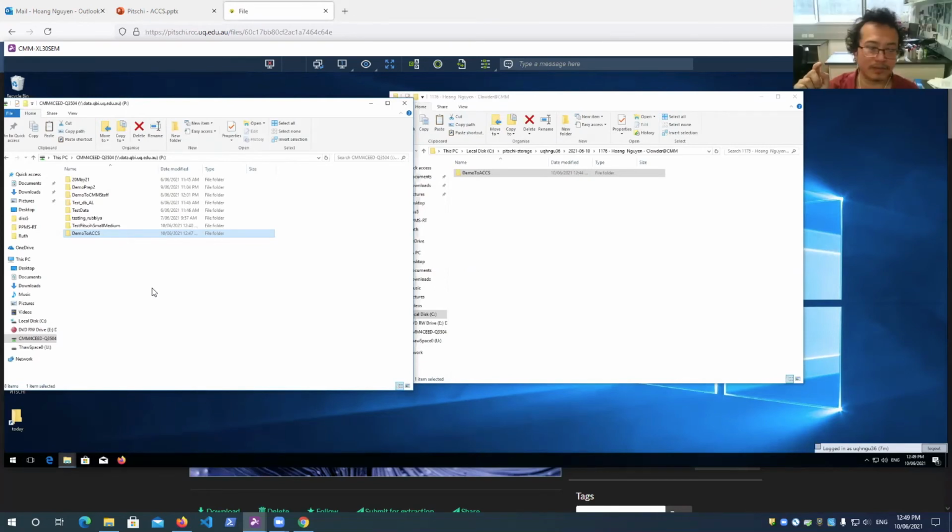So James, well, actually, before this demo, which is using PPMS, I do have it working with UQ login. But like I said in the slides, there's some cases in CMM where a certain program needs to be on all the time, so I cannot use it, but it does work with UQ login. With UQ login, you don't even need to see PPMS tracker. Yeah. But you still need a valid booking to start.